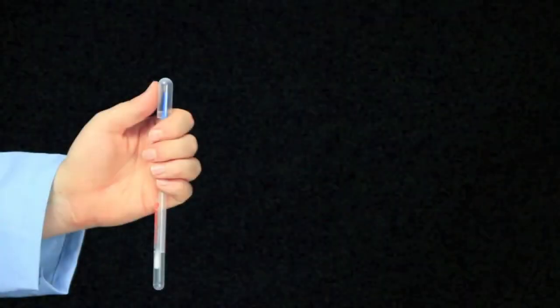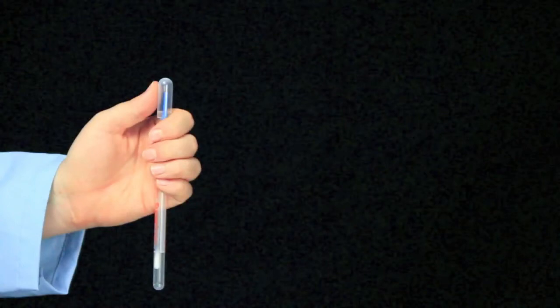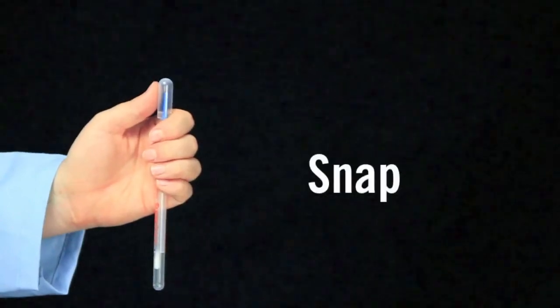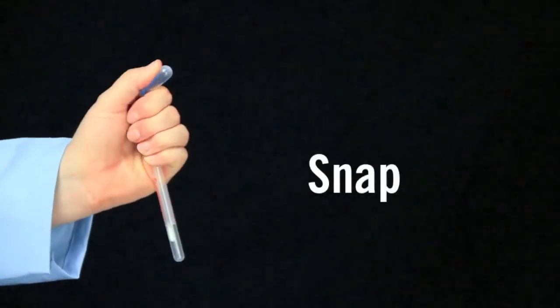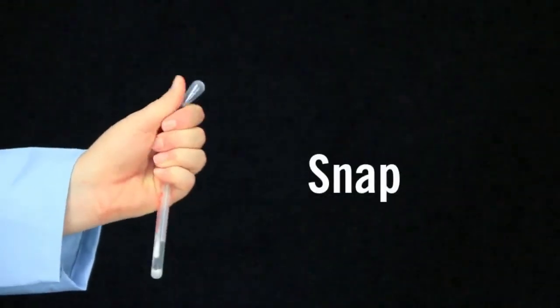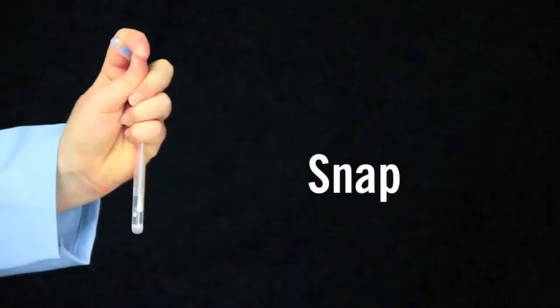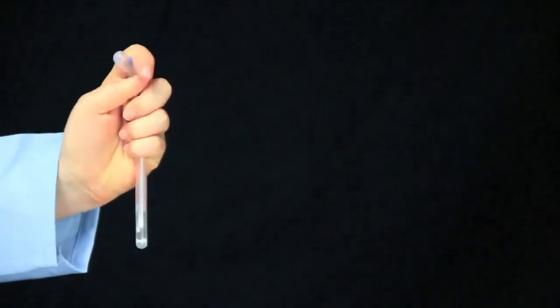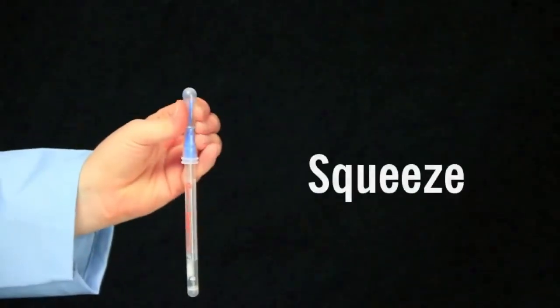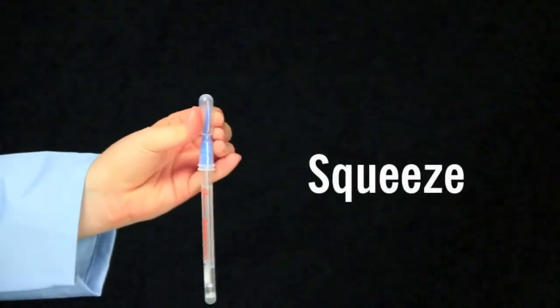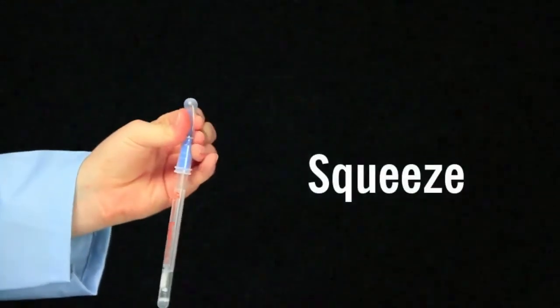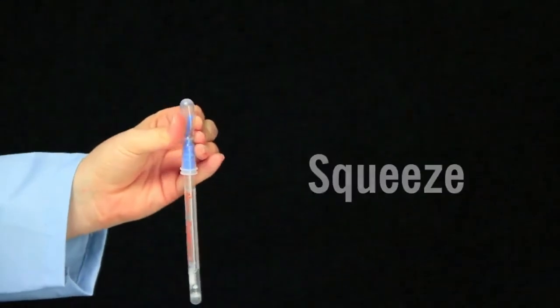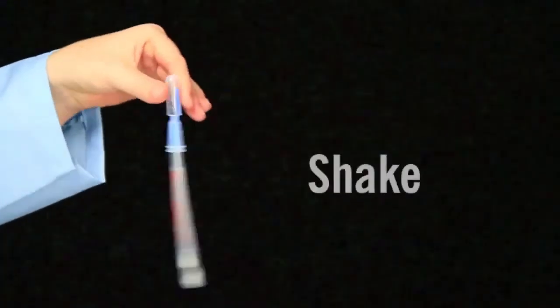The easiest way to activate SuperSnap is to hold the device in your fist and use the thumb and forefinger to break the snap valve by bending the bulb forward and backward. Next, squeeze the bulb to expel liquid into the tube. Then shake for 5 seconds.